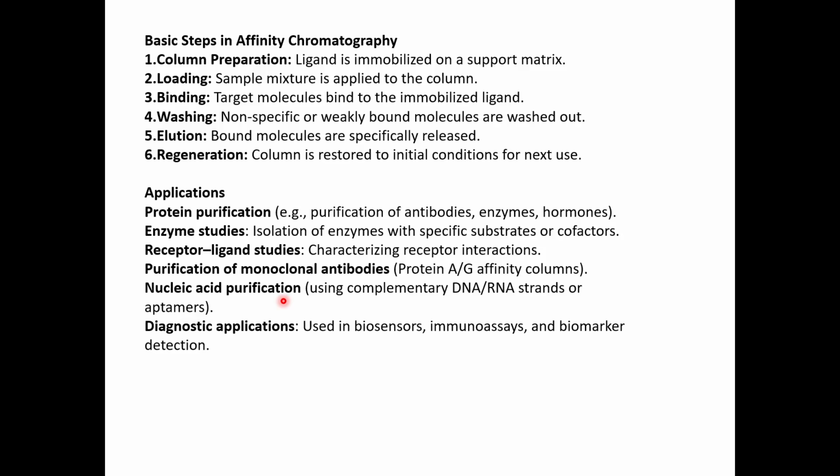So, like I said, not only proteins, we can also separate different biomolecules like nucleic acids. To do that, you need to use complementary DNA or RNA strands, or you have some things like aptamers, which are complementary to your specific sequences in your DNA or RNA.